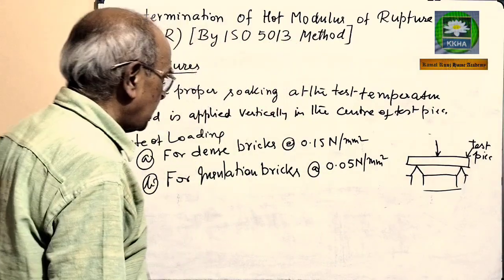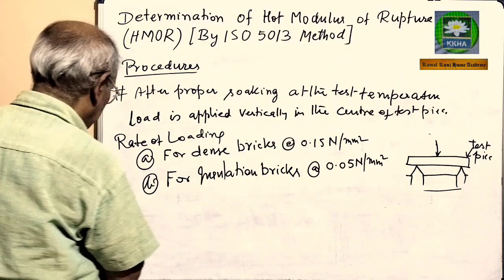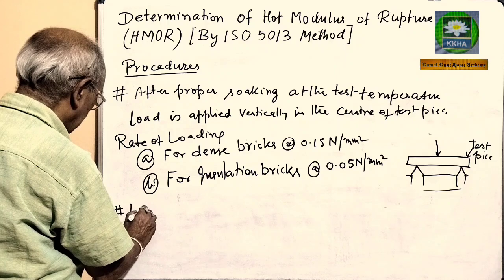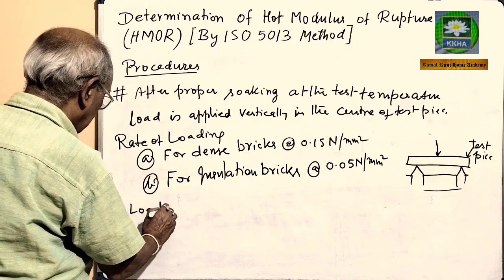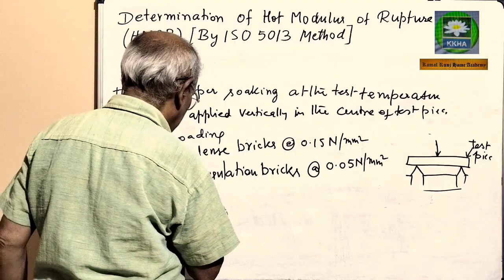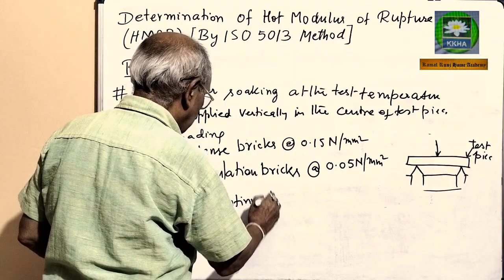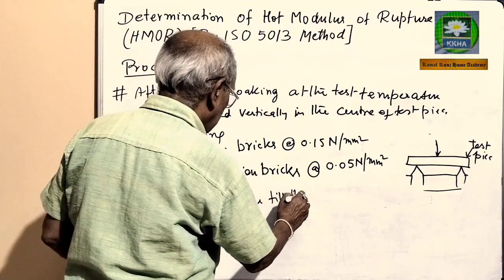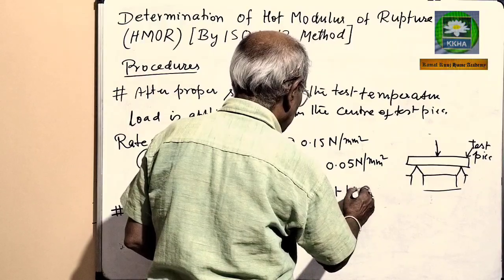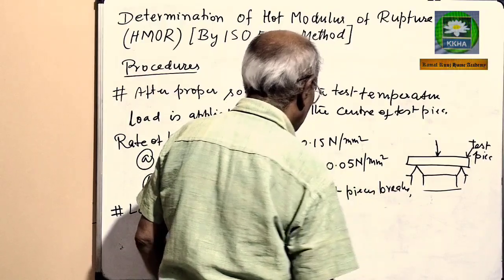Loading is done till the sample or test piece is broken. Loading is continued till the test piece breaks.